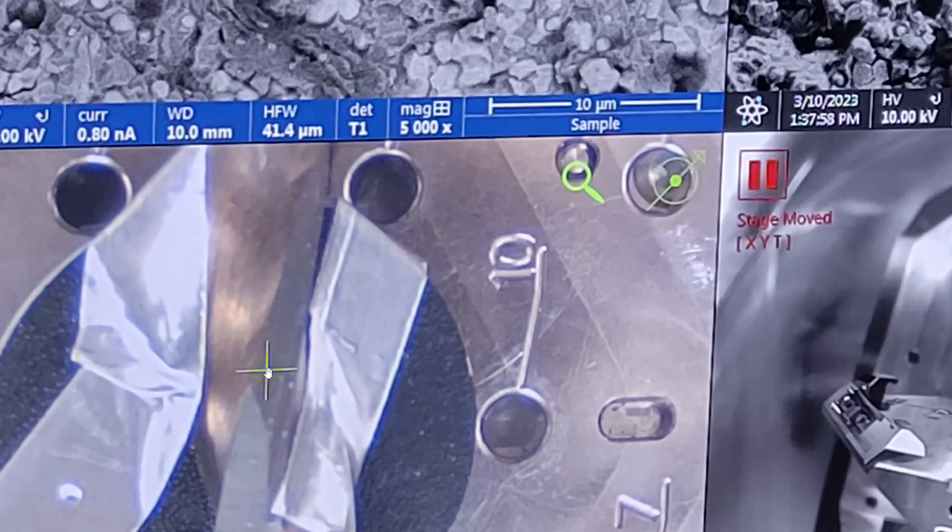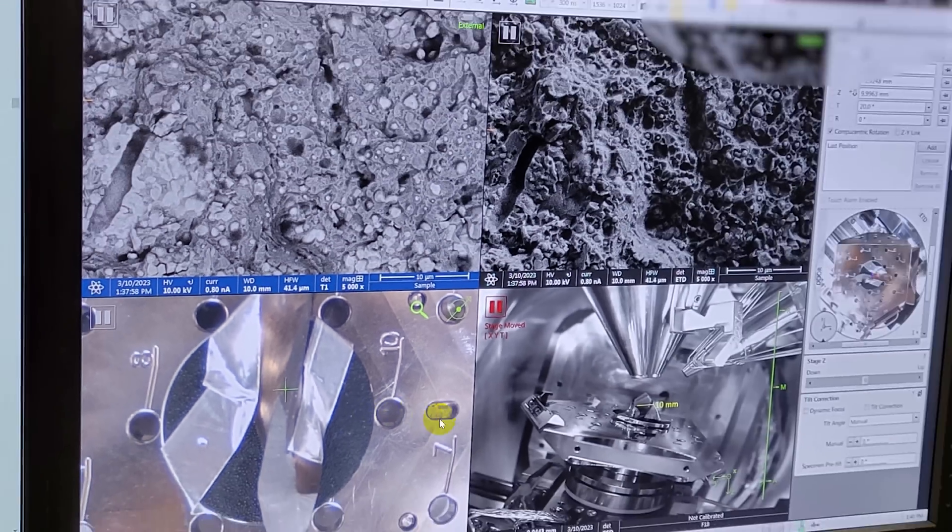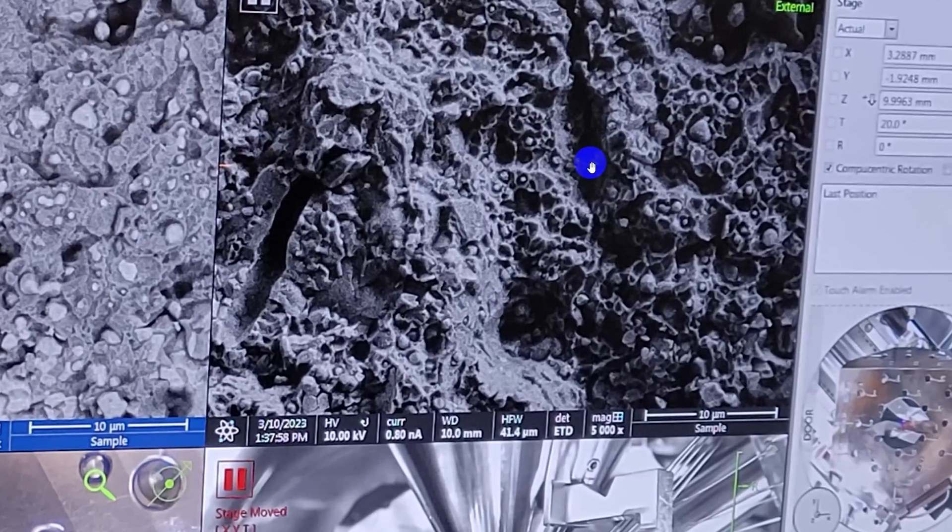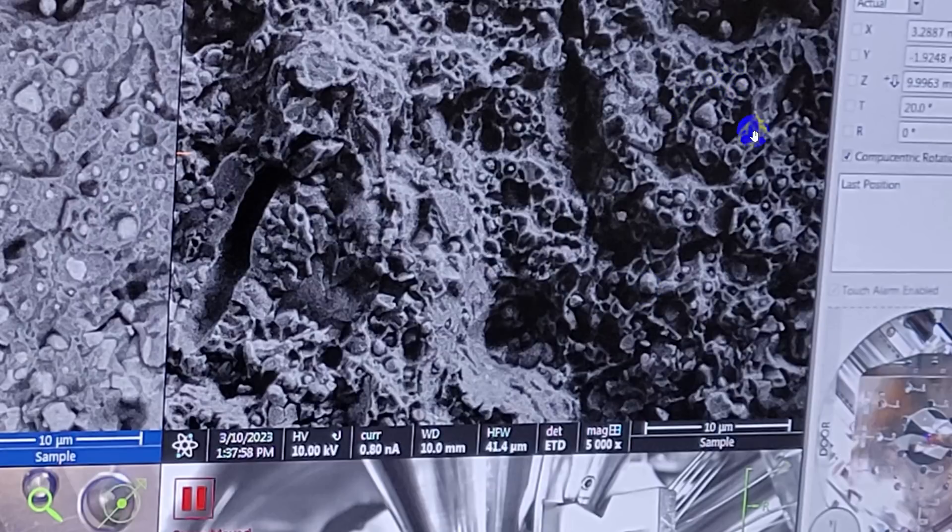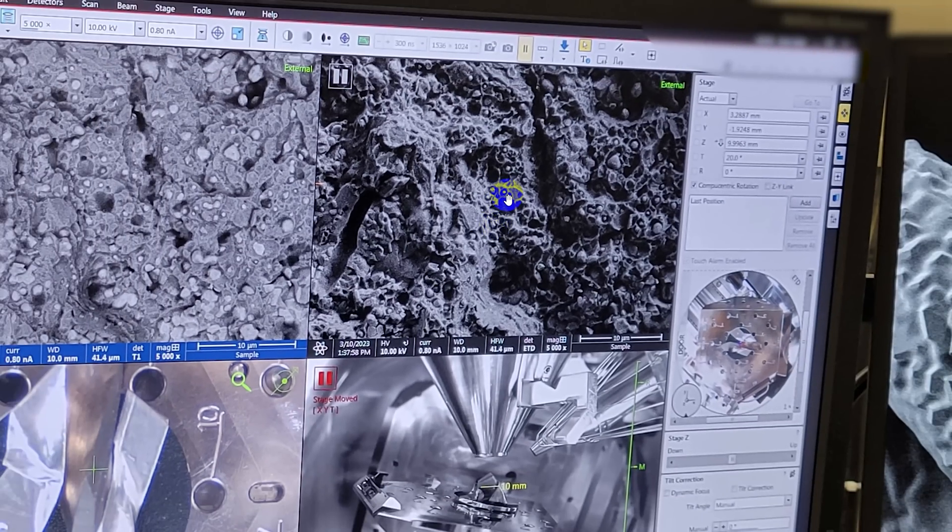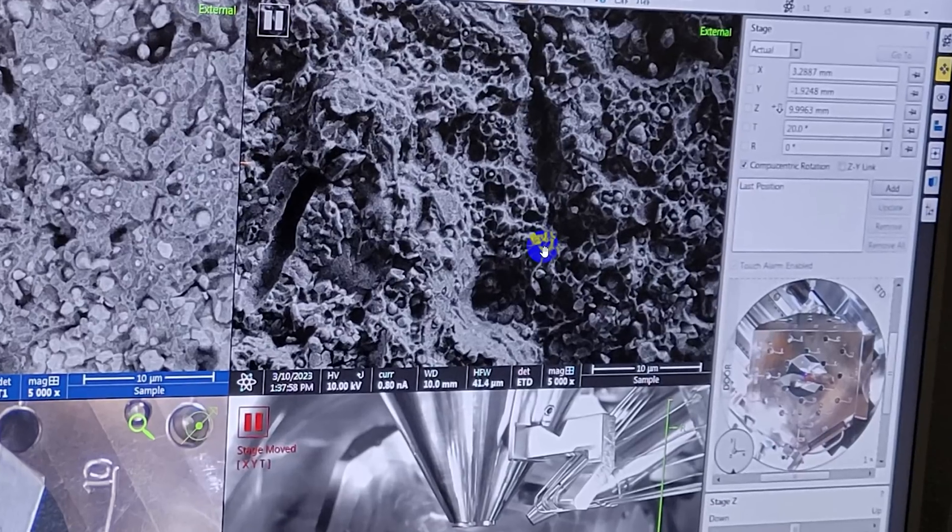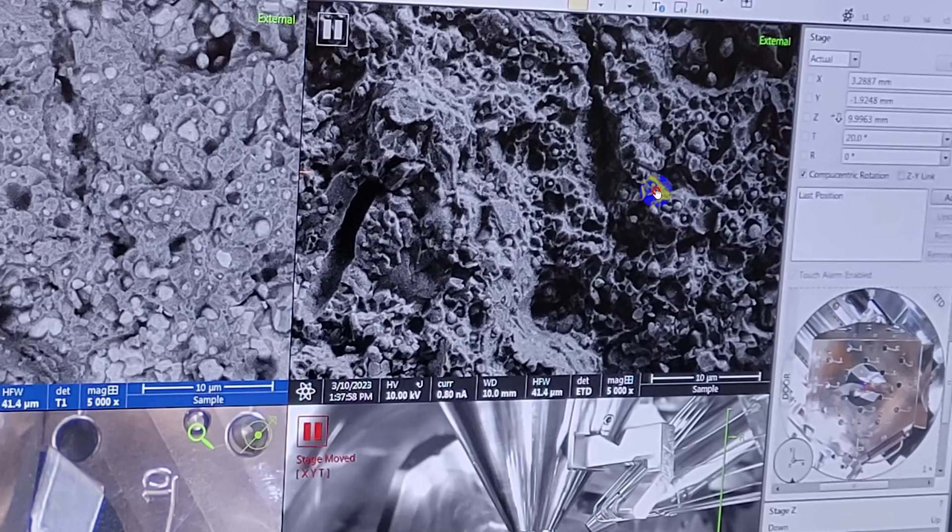Now let's take a look a little further up here on the sample in the dark area. This is the area that I am speculating was cracked from the factory and oxidized previously. And as you can see, the structure of the sample here is very different. Instead of having a lot of flat surfaces, there are a lot of rounded surfaces and a lot of little round pockets with little stretched out edges that pulled, deformed, and then snapped off. And you can see that the material around these phases is pulled away from it. The little voids in the material have coalesced as the material stretched out towards the camera in this view, and then ultimately snapped off.